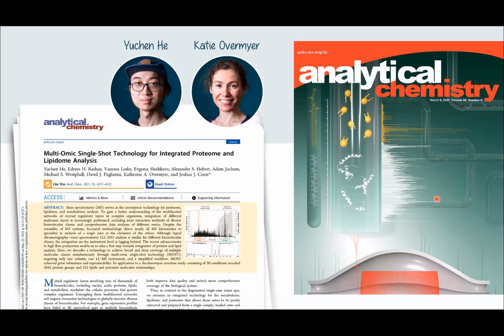So we've been developing this method we call Multi-Omic Single-Shot Technology, led by Yu Chen and Katie in my lab. And so here's the cover here. So we've got these lipids that look like teeth to me, and peptides all in the same column, and they just come out separately and they go into the Orbitrap.